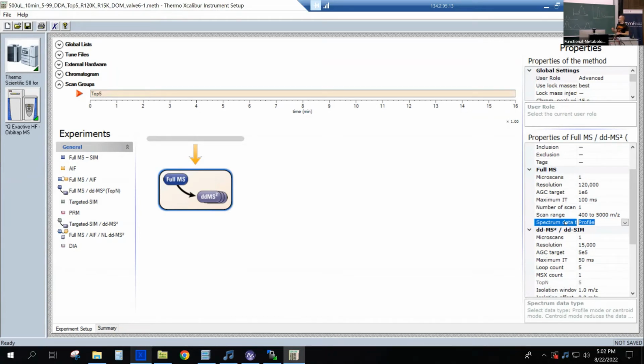And we can simply remove all these data points and only look at that one data point at the top, and then draw this as a line. Then instead of, I don't know, 1,000 data points, we have now only 3 for this particular peak. And that is called centroid. That is an important step we do in our data analysis tomorrow with MSConvert, or like Efi showed earlier with the raw file parser, which she used for the centroiding.